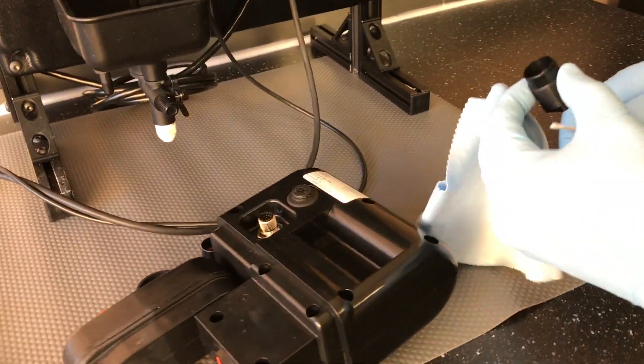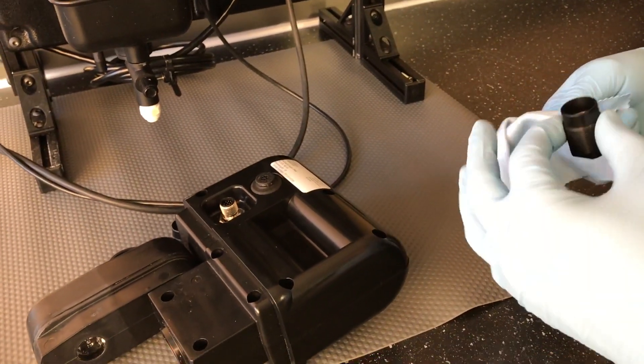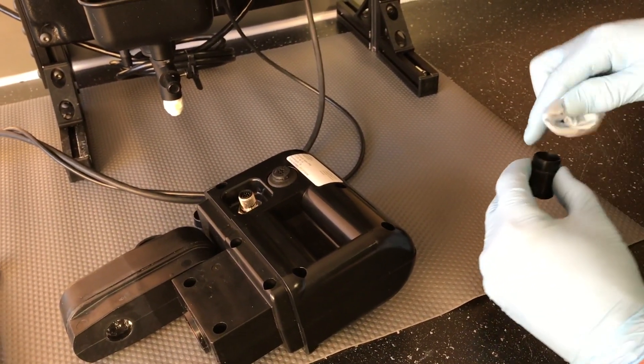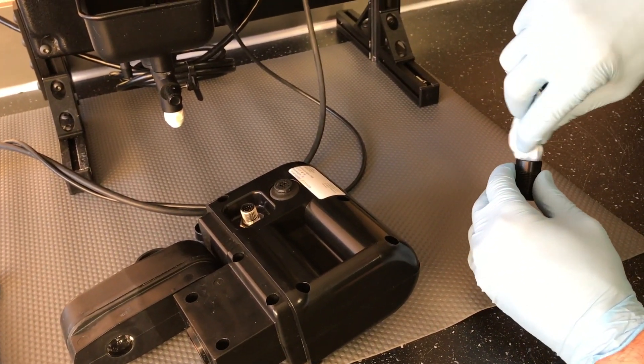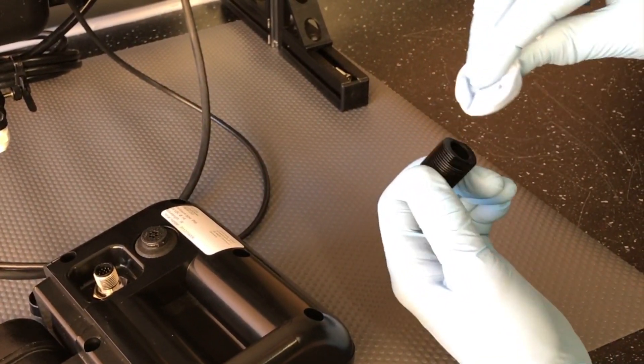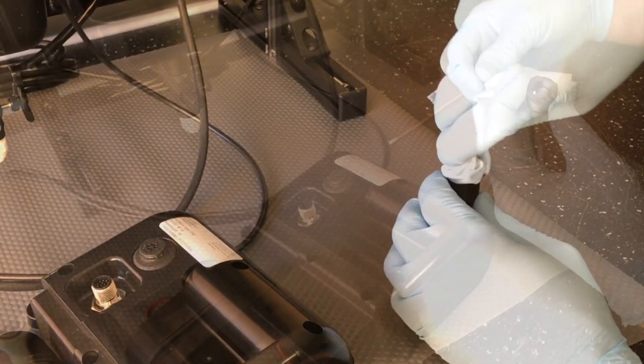Holding the illuminator lens assembly, use the cleaning cloth and cleaning solution to gently remove any debris or spotting on the optical surface of the lens.